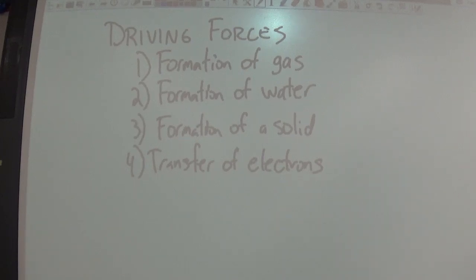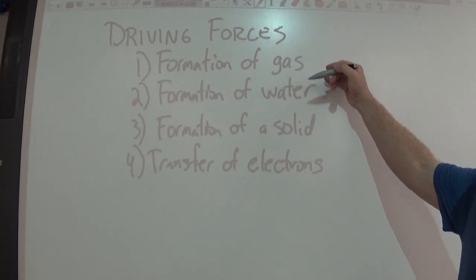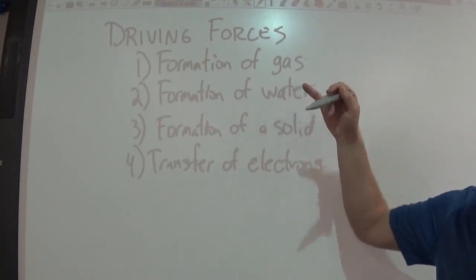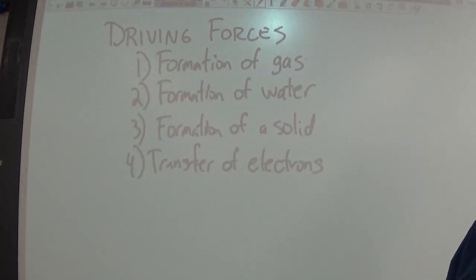As you do this lab, you're going to be mixing 9 different aqueous solutions together. And you're going to be watching to see, does a reaction occur? Now, most of them you will see a reaction occur because there will either be bubbles, or there will be a precipitate, there will be a color change, or there might be some energy absorbed or released. You're not going to be able to see that one. Those are the 4 visible evidences. You will be able to see the formation of a gas, and you will be able to see the formation of a solid. I'm going to tell you that as you do this reaction, you're going to need to be able to recognize water forming.